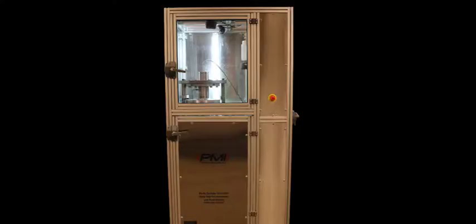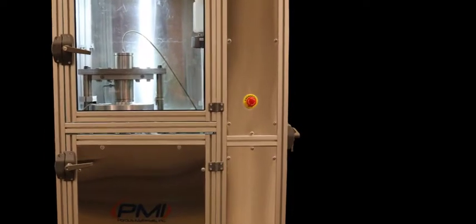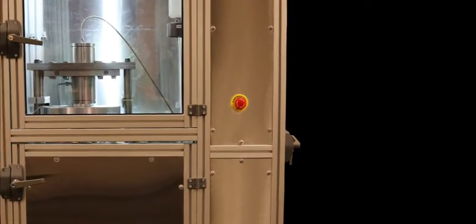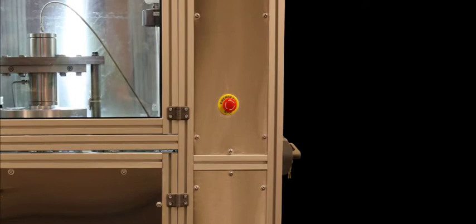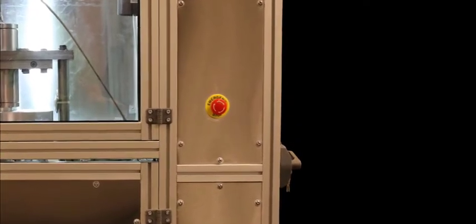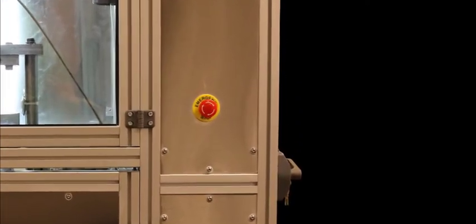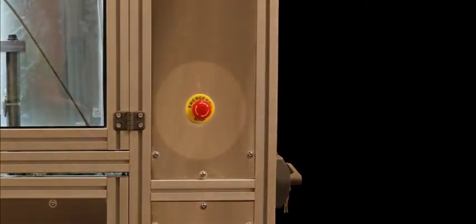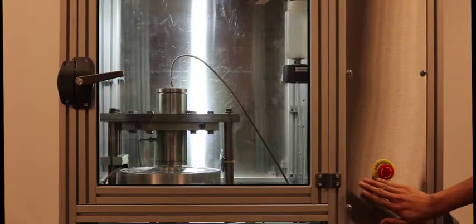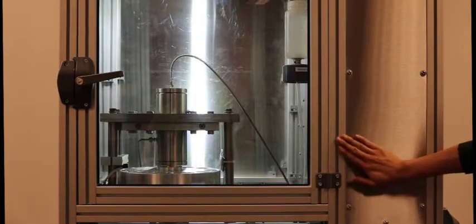We will begin operation instructions by covering the emergency stop button. PMI considers safety as a top priority and recommends you do as well. If the operation of the APDP-HP101 must be terminated due to emergency circumstances, a user may press in the red button located on the front panel. The machine will shut down.